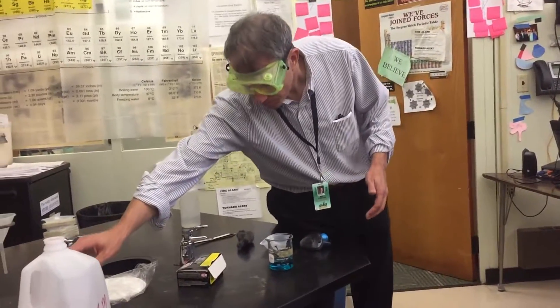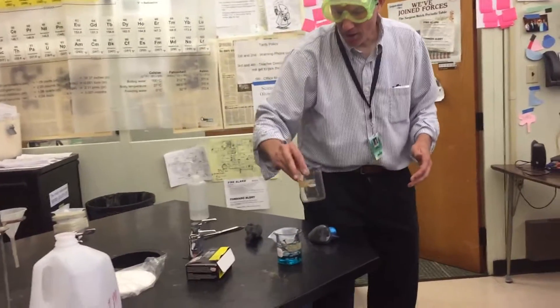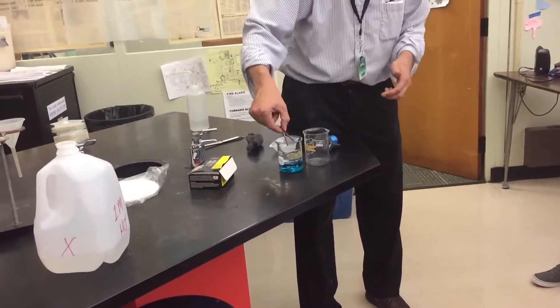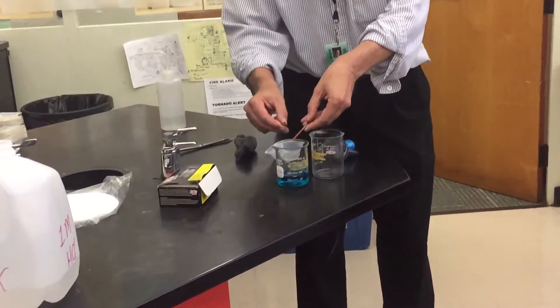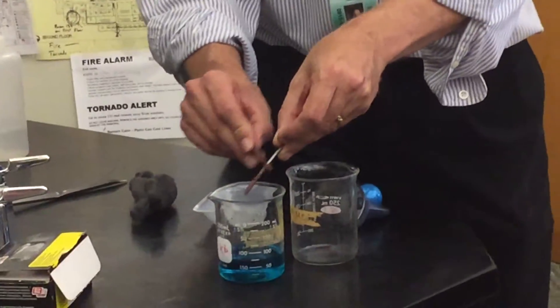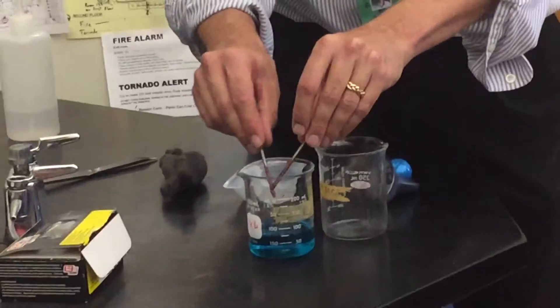So, first thing that we'll do is we want to get off the copper. So, basically, you'll pull these out like this, and the best way we've found to do this is like this. You want to try to get this off, doing this, get as much of the red stuff off as possible.